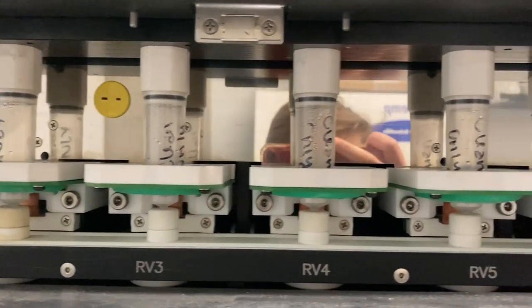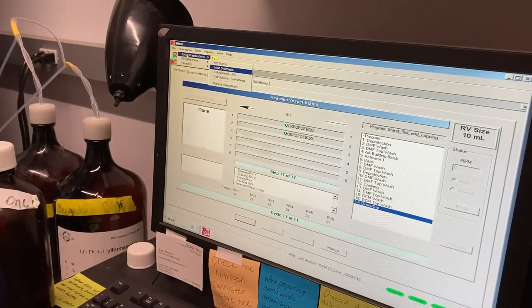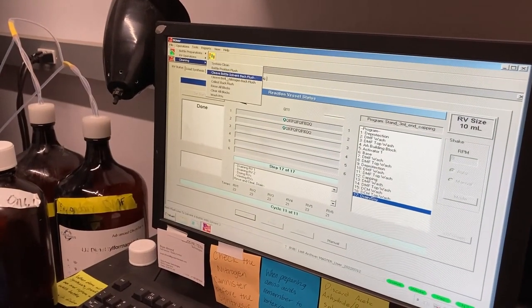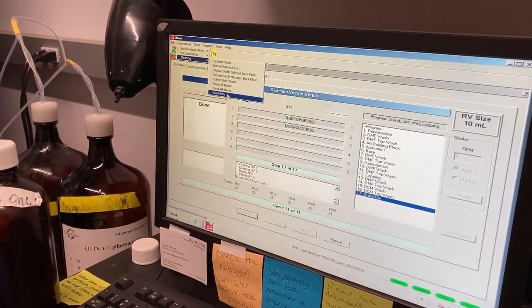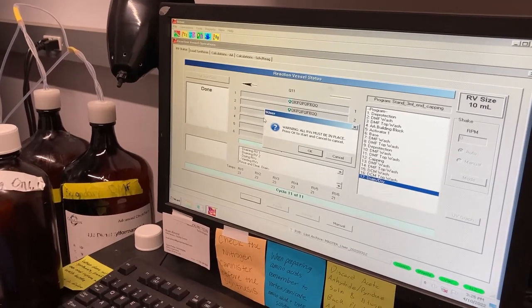Under the operations tab, under cleaning, select wash RVs. This runs DCM through the RV lines to flush out any residual reagents.